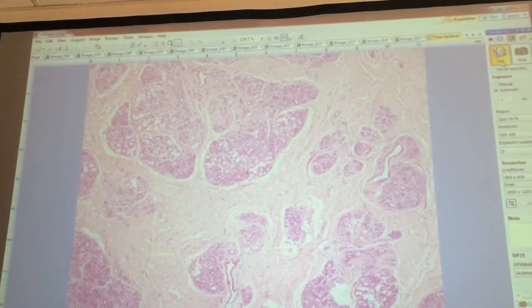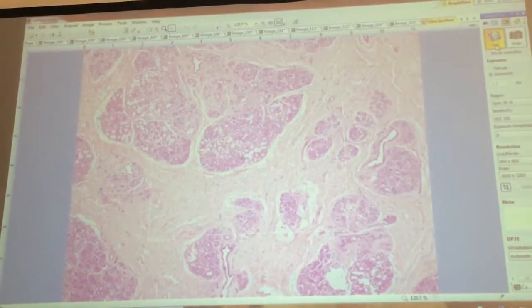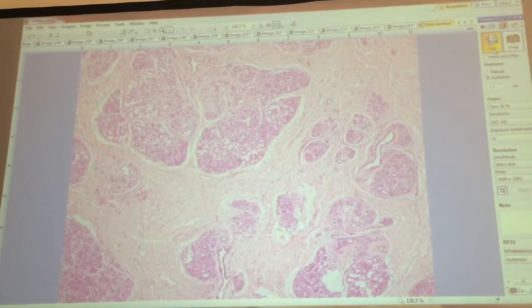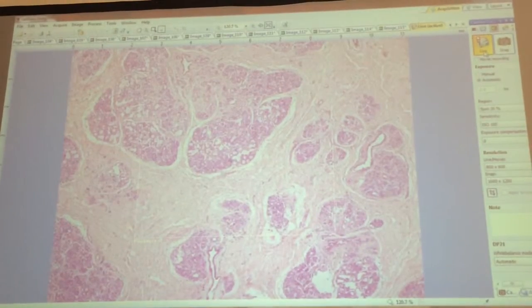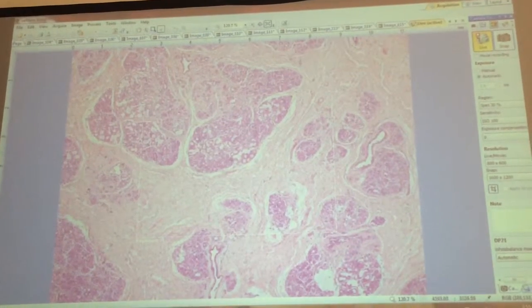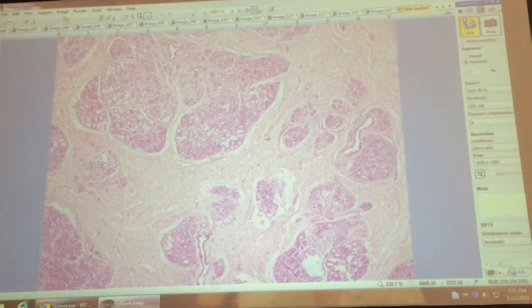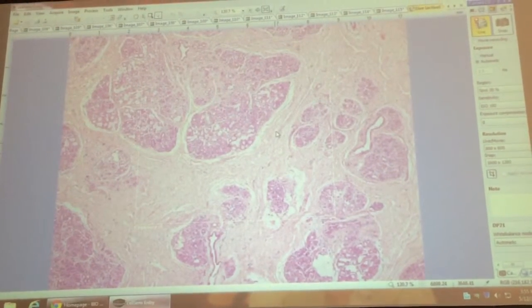Is there adipose tissue in the glandular structure? The glands are different because remember, glands are epithelium. They're just epithelium that dives down in. So there should be some adipose tissue surrounding the glands, but not actually within the gland themselves. So when you're seeing the glands here, those are mostly glandular, and you should see like little pockets of adipose tissue outside of the glandular tissue, which I'm just not seeing a lot of at this point, okay, in this particular slide.